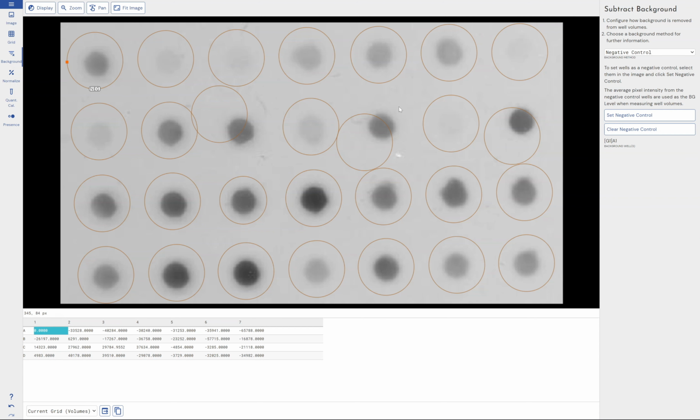So if you do have a negative control in your experiment that produces some signal, you can remove that signal from every other well so that you're only analyzing experimental results. Increases, changes that are down to your experimental protocols, your treatment groups, your different groups, whatever it may be, not just influenced by the inherent autofluorescence you've got in your system, for example, something like that.